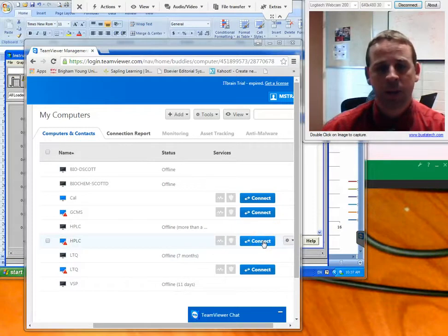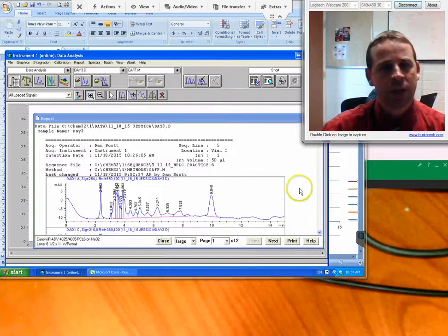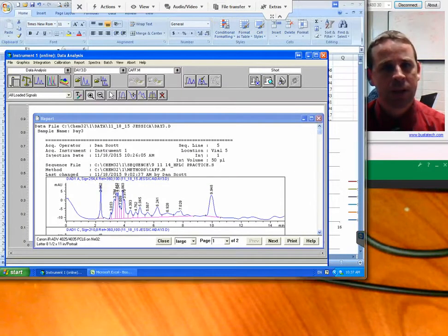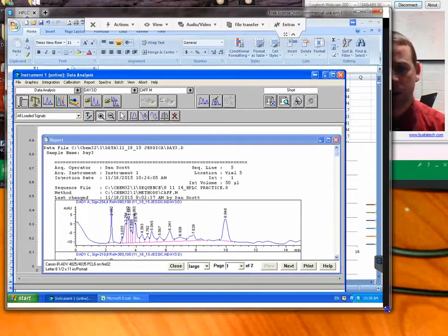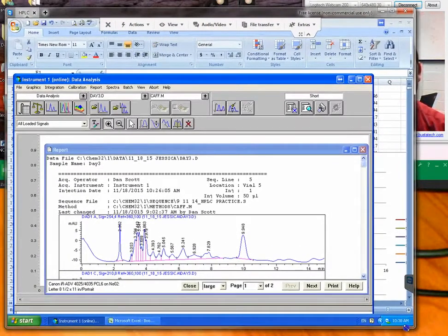But if you're not working on that, after you click connect it's going to open another window asking if you want to download the software or continue on the web client. Push continue on the web client if you don't want to download the software, and then it will open up a window that looks something like this. Hopefully you can get to it without downloading if you don't want to. If you want to download it, go ahead. But anyways, this is what we're looking for.